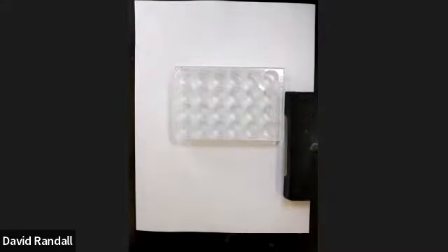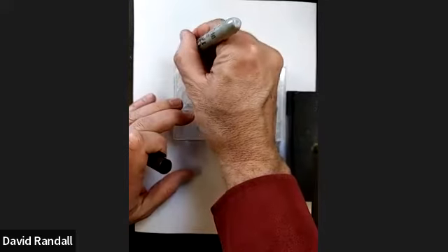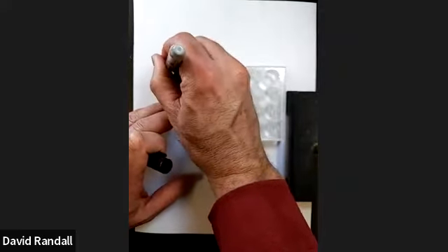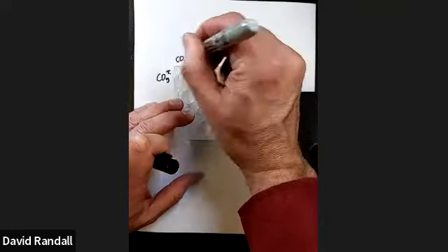Hi, we're going to make a video about how to do lab number 21. I've got everything set up, and we'll do a mini version of it here. Here we have our little layout, and we're going to take carbonate, CO3 2 minus, and nitrite, NO2 minus.